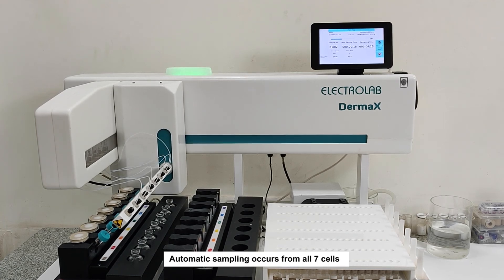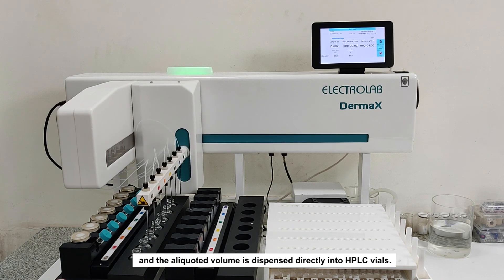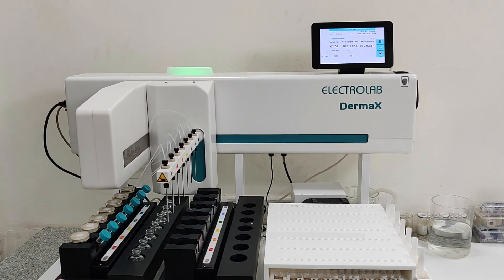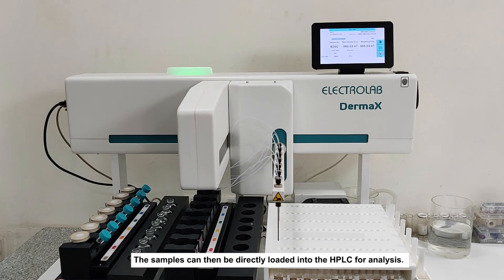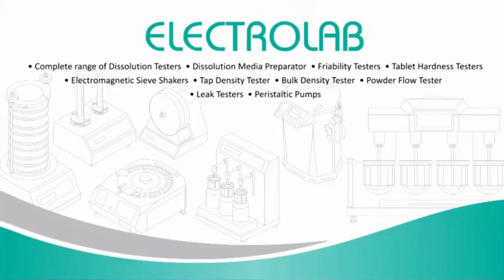Automatic sampling occurs from all seven cells, and the aliquoted volume is dispensed directly into HPLC vials. The samples can then be directly loaded into the HPLC for analysis.